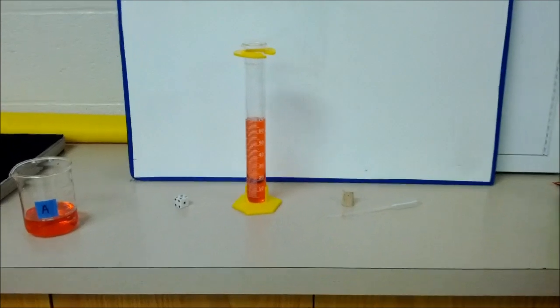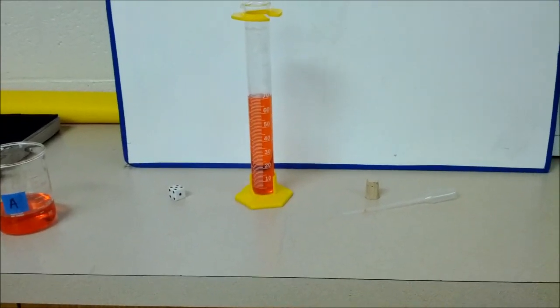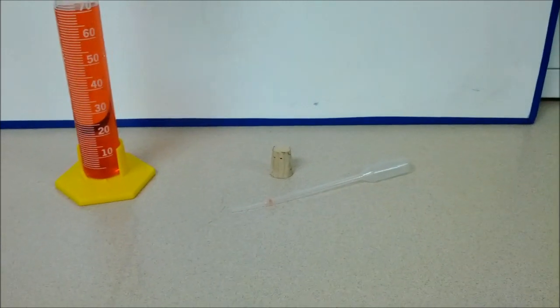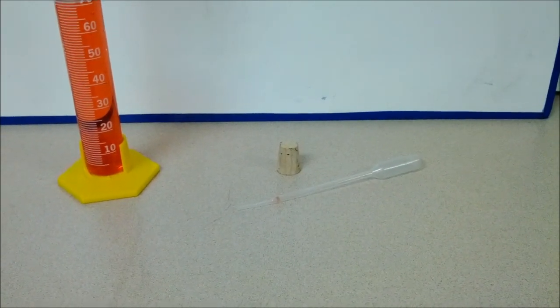So the volume of our number cube is 3 milliliters. And that's how we find volume of an object through displacement. Thank you, ladies. Okay, this time we're going to find the volume of an object that will float. In other words, it is not as dense as water.